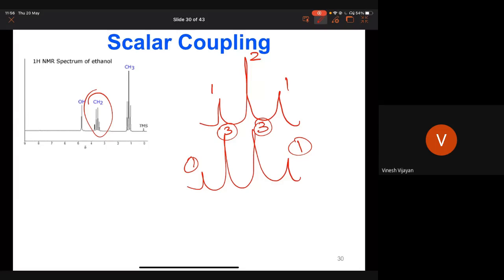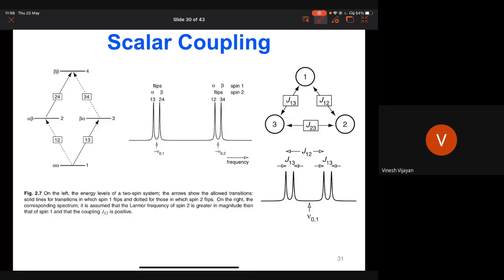Okay? So not just in terms of fine splitting, in addition, even the type of splitting that you get, you'll be able to know what kind of a neighbor is being present. There are cases where you could have a spin one neighbor that is present. Somebody asked, what if we do NMR with a non-spin half system? You will actually be able to see all that information and fine structure splitting. I hope the last 10-15 minutes have made you understand the influence of the chemical shift and scalar coupling in order to get atomistic insights into the molecule that you're trying to probe. So this is the example I was trying to show. When you have two systems that are being present, it's going to be split. And if you have systems that are involved in a different fashion, you could actually further split a given multiplet and so on and so forth. As I said, due to a lack of time, I don't have the time to go into details.